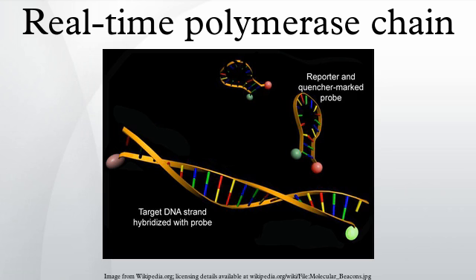The cycle threshold method makes several assumptions of reaction mechanism and has a reliance on data from low signal-to-noise regions of the amplification profile that can introduce substantial variance during the data analysis. To quantify gene expression, the Cq for an RNA or DNA from the gene of interest is subtracted from the Cq of RNA or DNA from a housekeeping gene in the same sample to normalize for variation in the amount and quality of RNA between different samples.